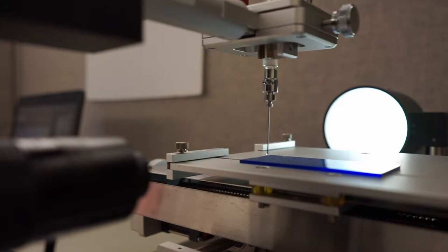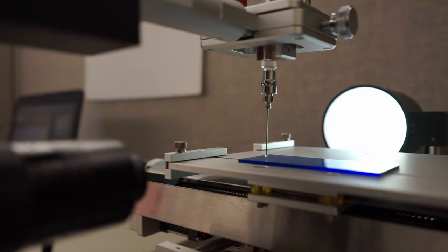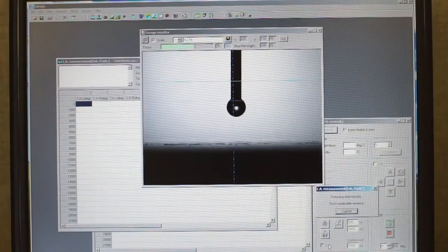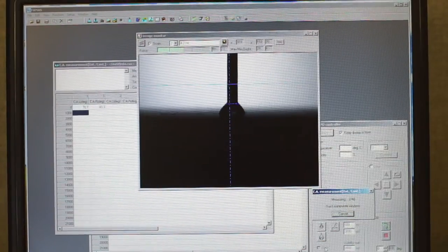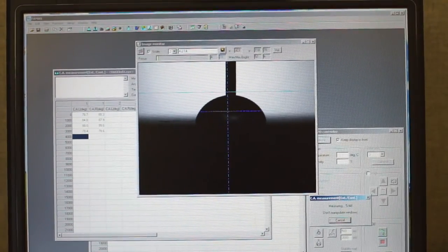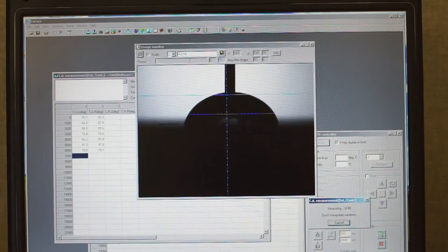Additional testing such as the sliding angle, advancing and receding angles, surface tension via pendant drop method, and surface free energy can be conducted as well. The Kiowa MCA-3 microcontact angle meter is especially amazing because it is capable of performing contact angle measurements on surfaces with micron dimensions using picoliter droplets.